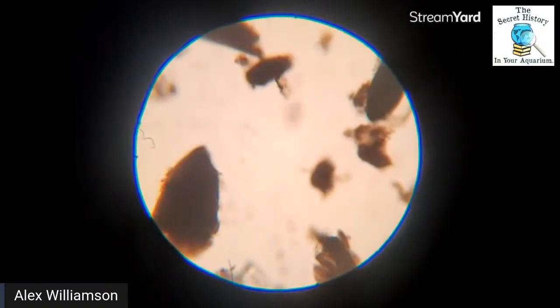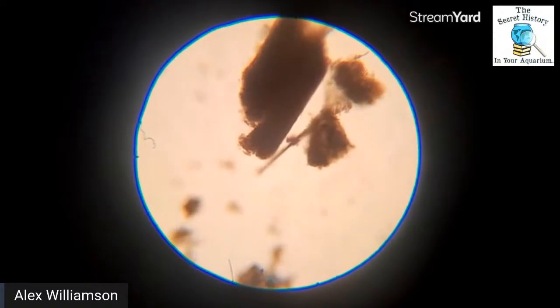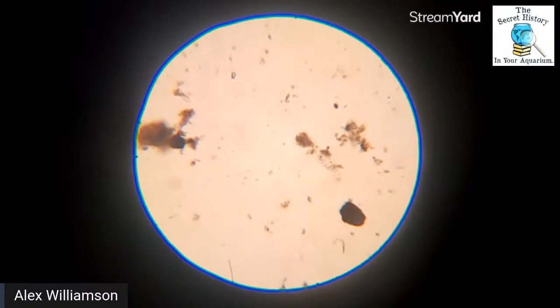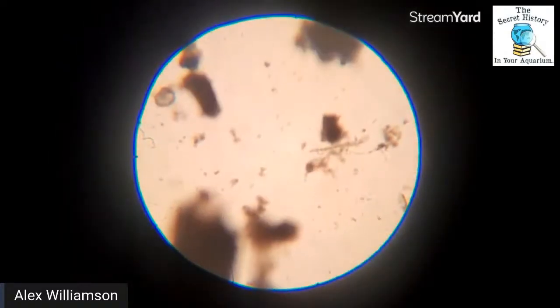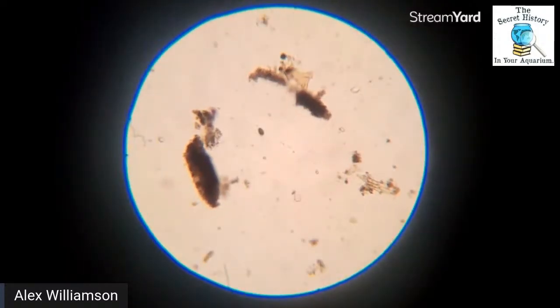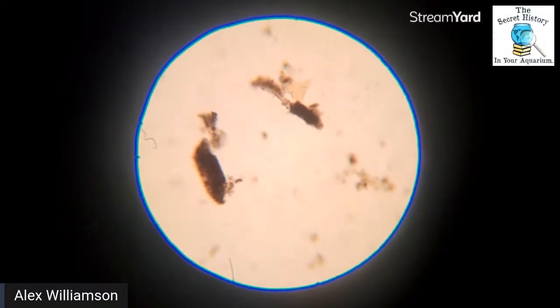Here we go. Here's some little... where'd they go? Come back. It's a rare breed? Sweet. I don't know much about stentors other than they're a group that has specific characteristics, and they kind of look like a big old funnel or triangle. So here you've got little microorganisms cruising by still, just doing their thing. Just organisming.